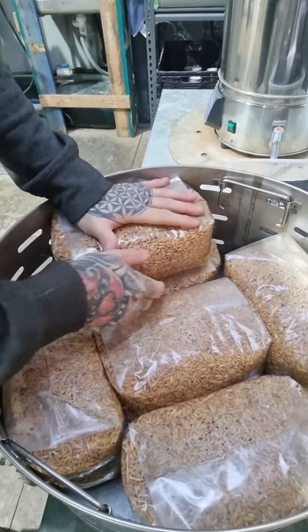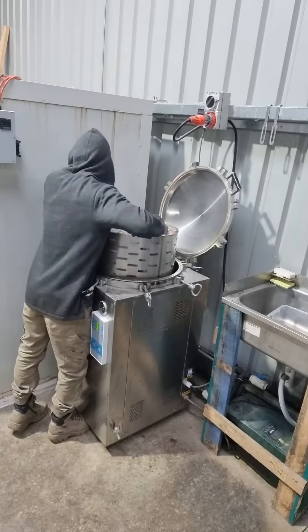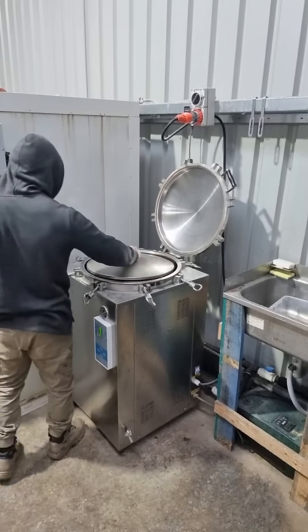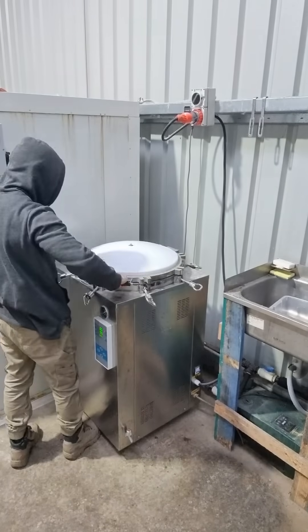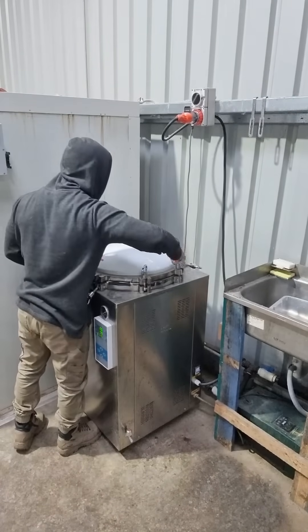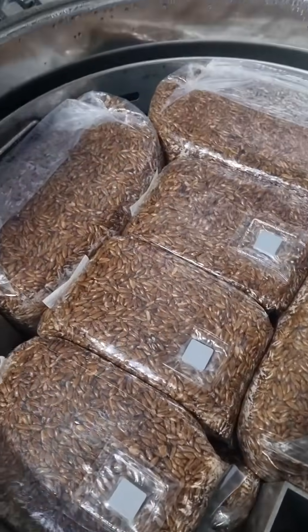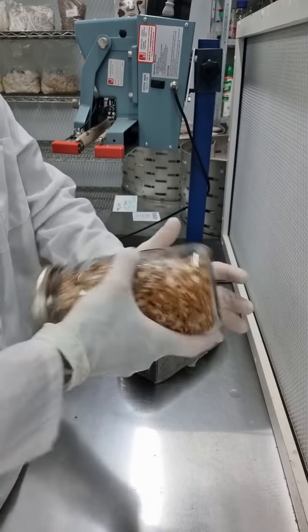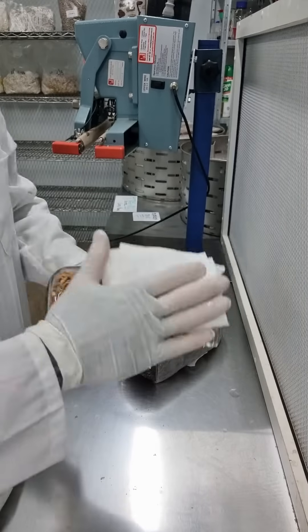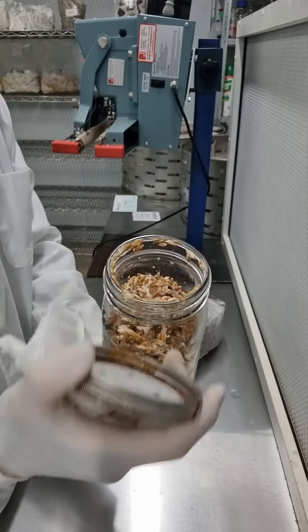These are what's known as spawn masters, and we can then use those to expand onto these larger bags of spawn that you see here going into the autoclave. We then use those larger bags of spawn to inoculate the substrate. These get cooked under high temperature and high pressure to kill off any competing organisms, and then once they're cooked we go into the lab and inoculate the new larger bags of spawn.